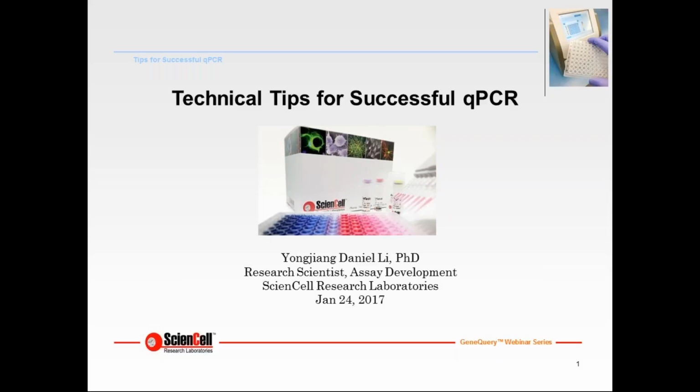In our previous webinars, my colleague Dr. Jennifer Tang talked about qPCR basics and how to optimize primer sensitivity and specificity. And Dr. Jennifer Walser shared some advice we have for primary cell culture. If you'd like to review those webinars, you can go to our website /technicalsupport/webinars, or simply Google ScienCell webinars to watch or download the presentations. Today, we will continue to share several technical tips for successful qPCR.